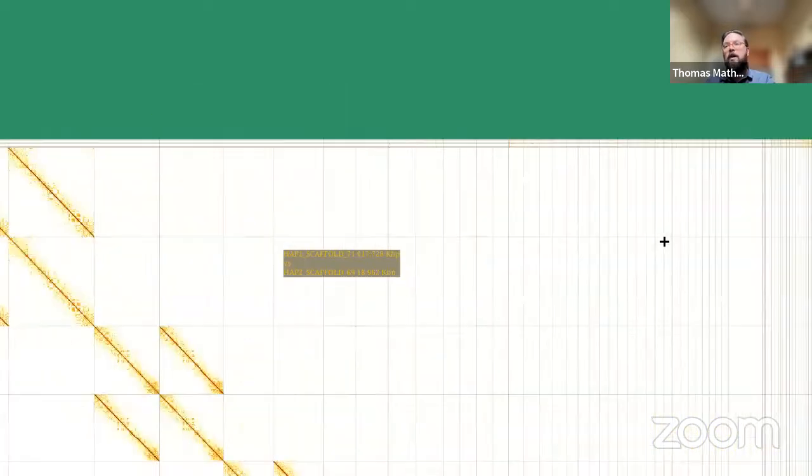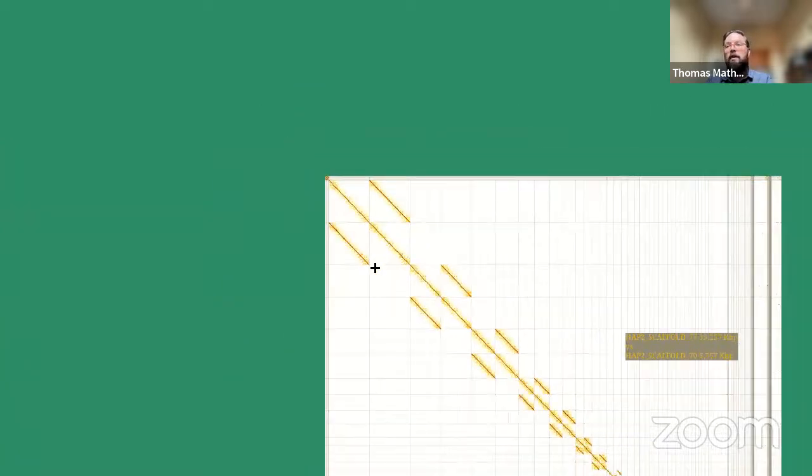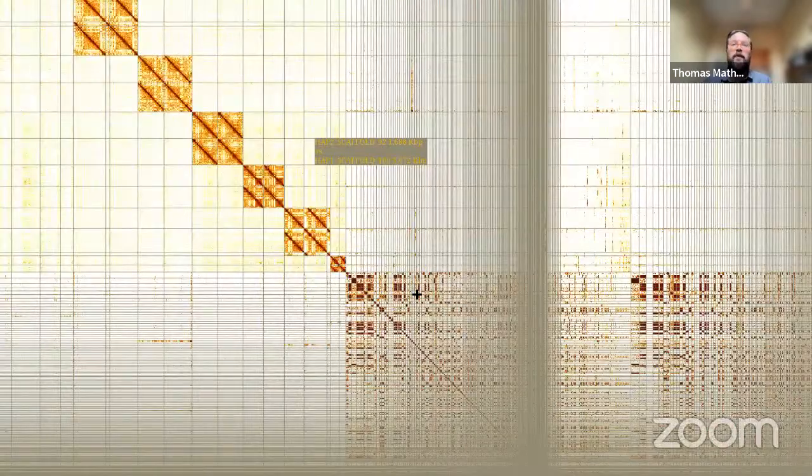This is the start of hap2. Pick these up, move them across, drop them down. So this is all scaffolds which are potentially microchromosome associated. So if we go down the map, what I like to do first though is place as much content as you can from the shrapnel into the main chromosomes, because otherwise you can get stuff that looks like it might be an individual chromosome, but actually it just needs placing into one of the larger chromosomes.